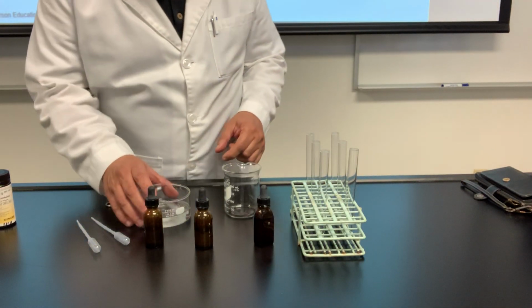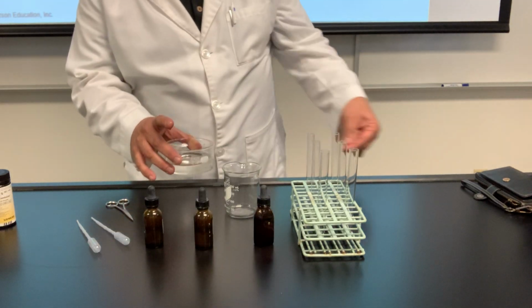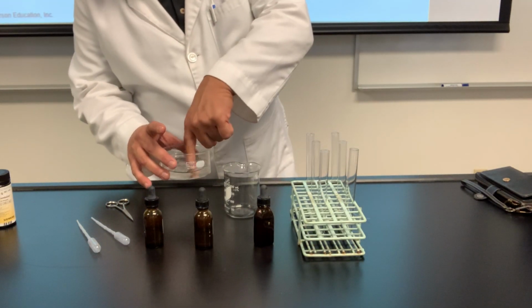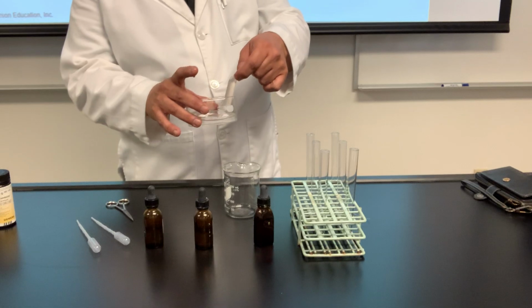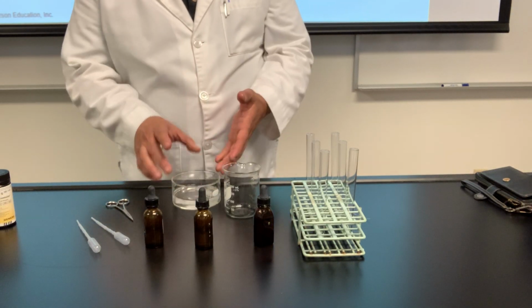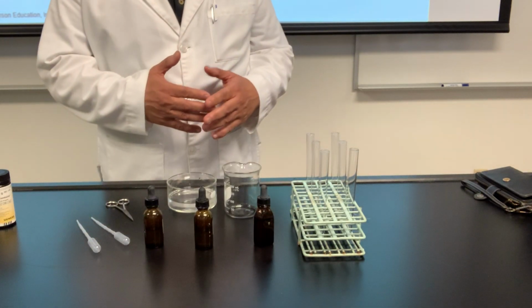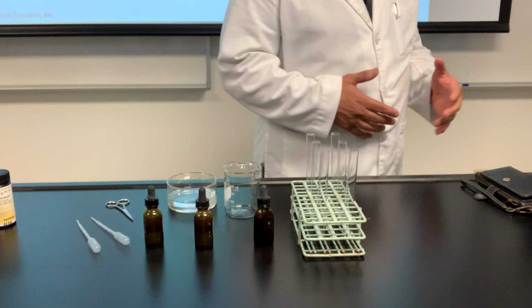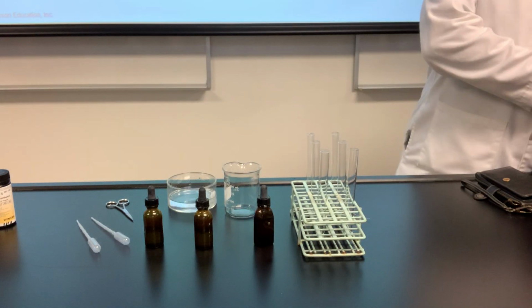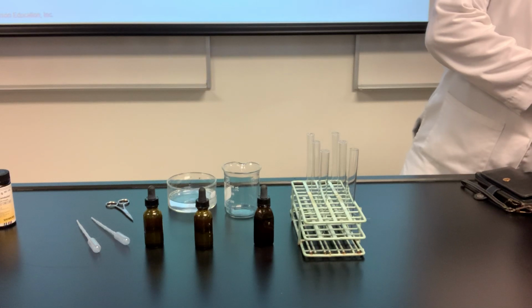So what's happening here is that there's a dialysis tubing with solution A in there. And outside of that is solution B. And it's been sitting in there for all this time since we started, preparing things. So what's in solution A? What's in solution B? Can you get me my lab manual again? Right there, yeah. Thank you.